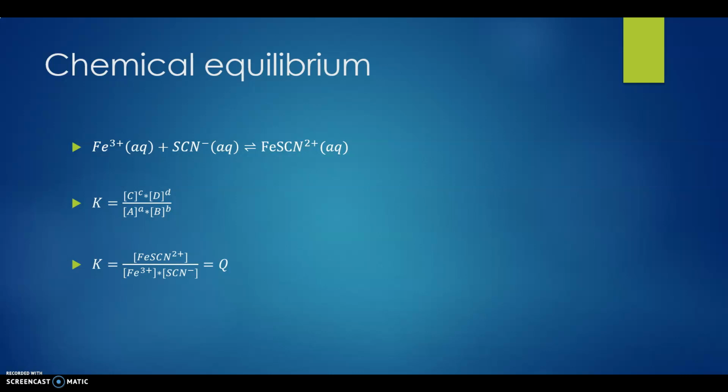Okay, so in the first test tube we wanted to add iron-3 ions to see what kind of change there were, and when we added the reactants, it caused the reaction to use them, which is why it goes down again, and also thiocyanate goes down to make the products on the right, and therefore we get a new equilibrium.